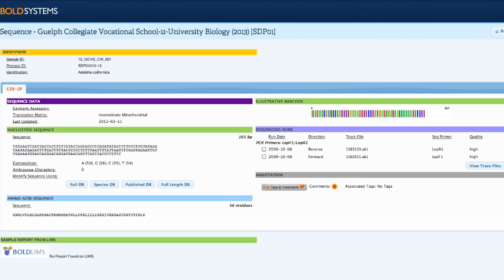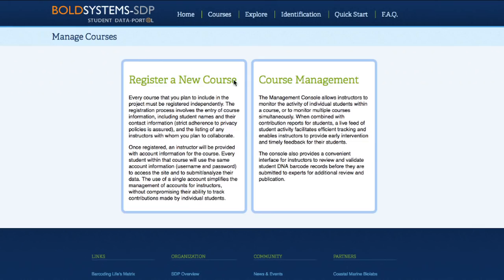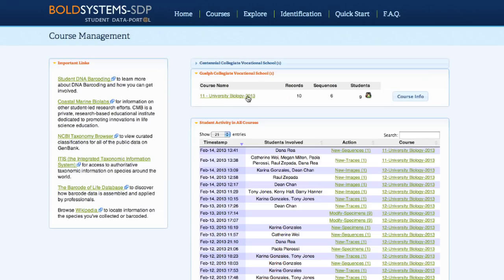Now all the elements have been added to the record, and the record is complete. Instructors will need to log in to their own account to view student-generated records. From there, going to the course management console will allow instructors to view all of the data that's been uploaded to their courses.